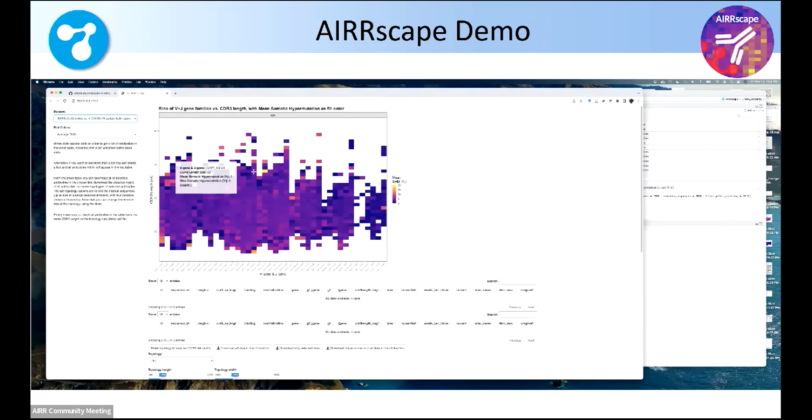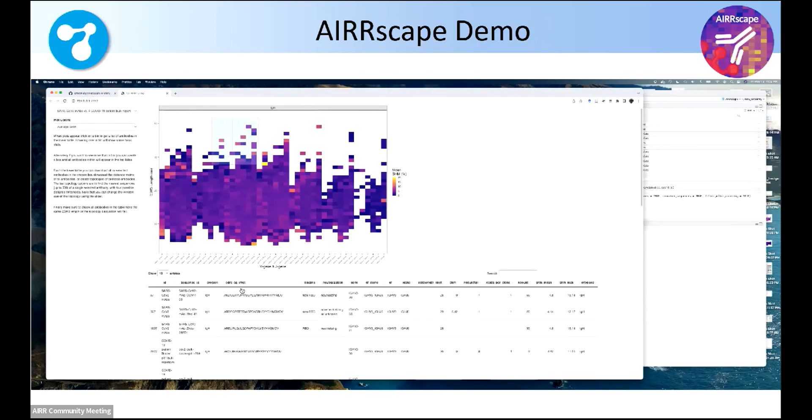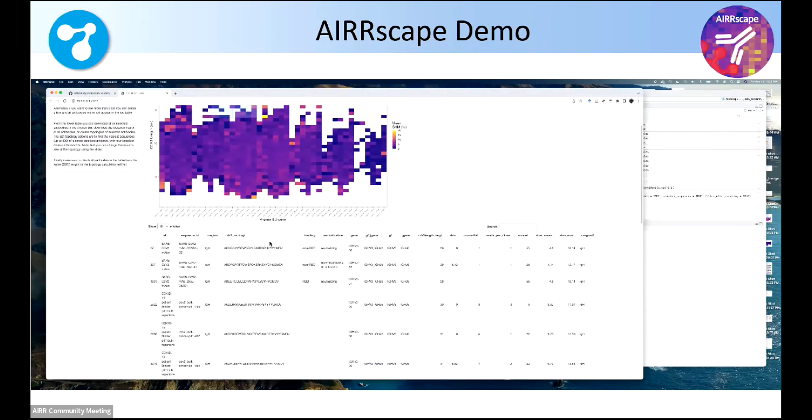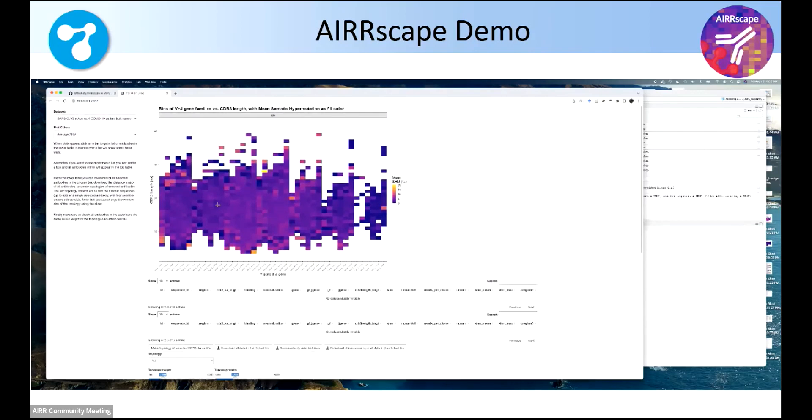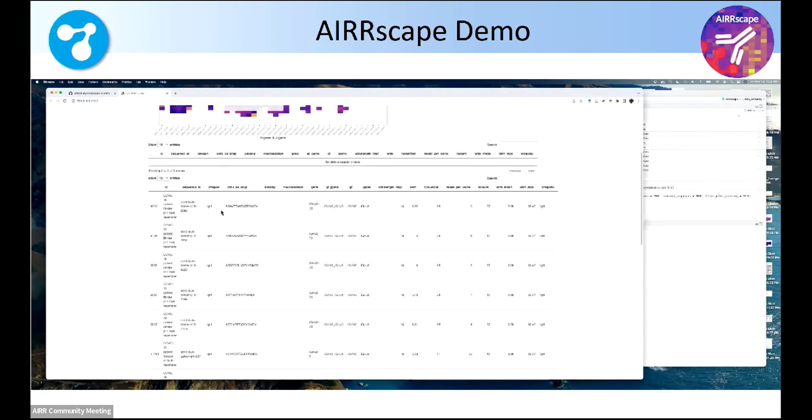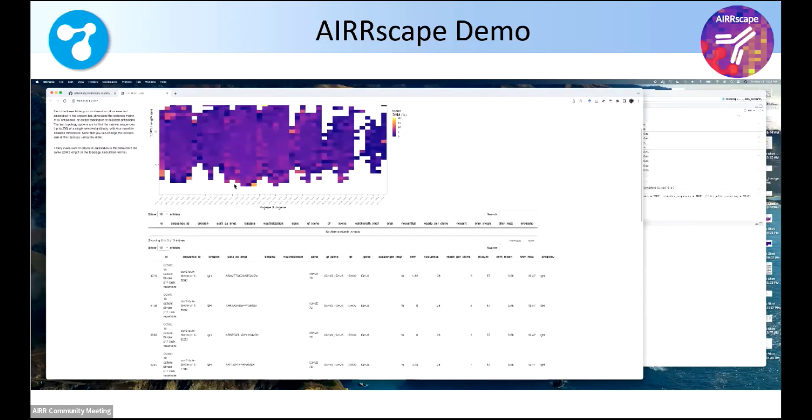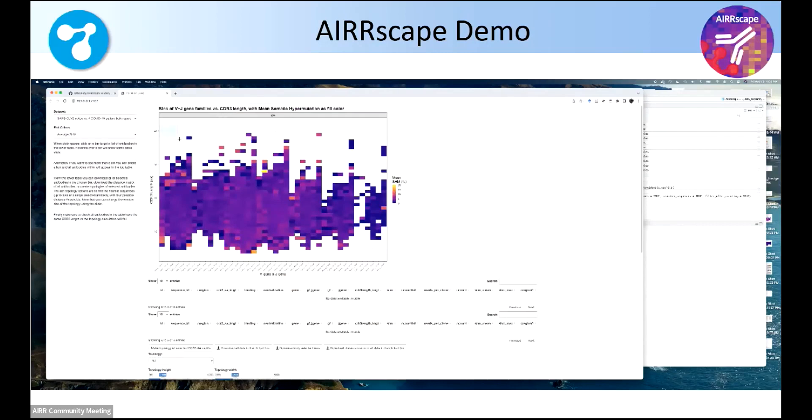So now here's some of the interactivity. So I'm hovering over each bin, and you can see there's a little pop-up window that gives you some of the information. You can also make a little square and get a list of all the antibodies in a table below. You can also click through. You get a list of all the antibodies and all of those columns. I want to point out the CDR3 sequences are also in there.